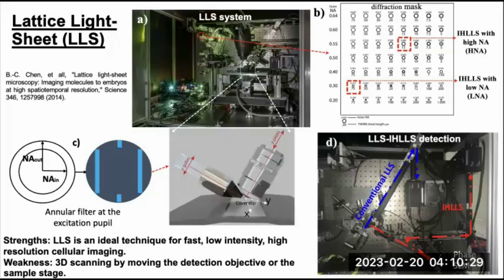Lattice light sheet microscopy was developed by Eric Betzig at Janelia Research Campus. Cylindrical lenses stretch and collimate the beam to form a sheet projected onto a binary spatial light modulator, with the acronym SLM. The SLM generates an optical lattice of Bessel beams. An optical lattice is a periodic pattern of non-diffractive beams. An annular mask acts as a zero-order filter, removing artifacts and lengthening the sheet.